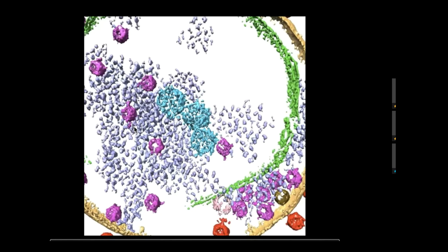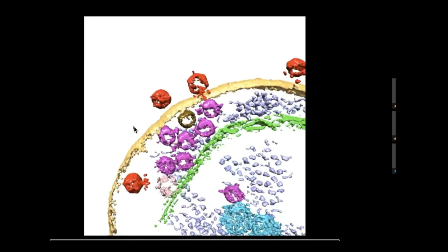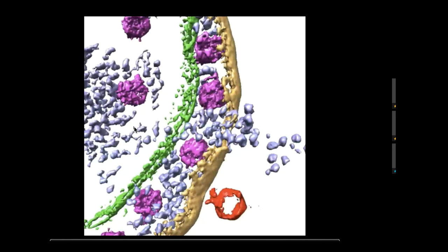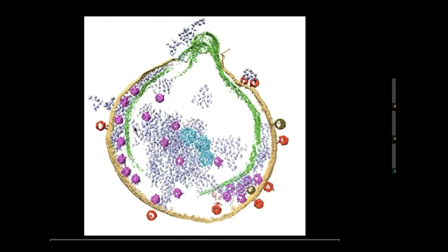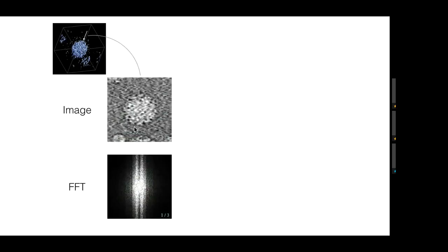The next step is to annotate what we actually have — various cellular features. Some of the large objects are carboxysomes, not phage capsids. We can annotate the infecting phages, and we can actually see baby phages inside the cell that have been produced after infection. You can also see ribosomes leaking out of the side of the cell. One of the goals of cryo-ET analysis is to extract particles from situations like this and do true in-situ structural biology — not relying on purified molecules, but actually observing what's happening inside the cell.